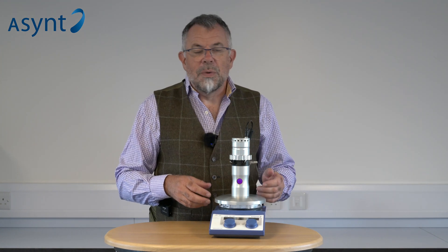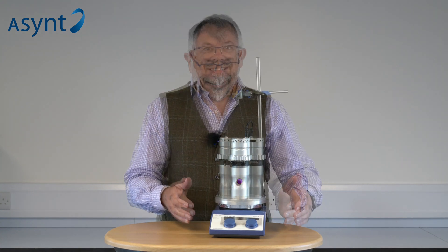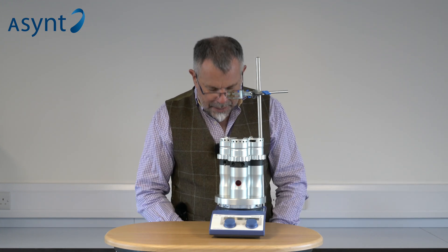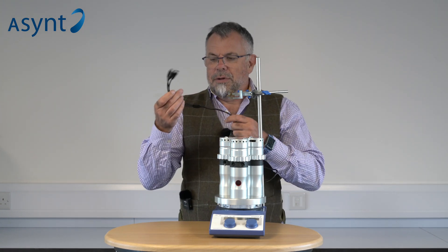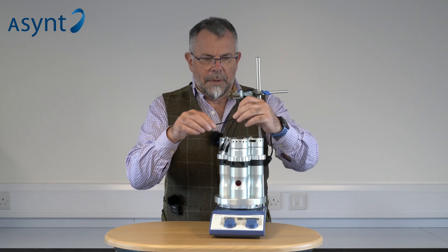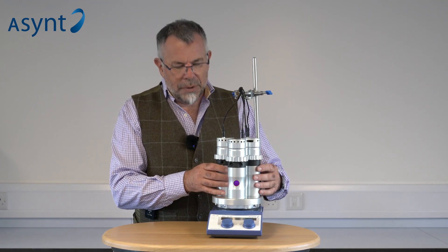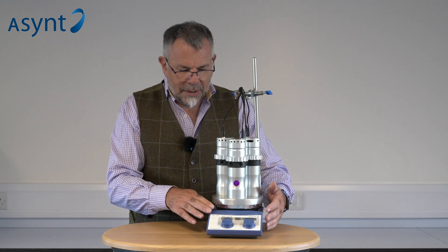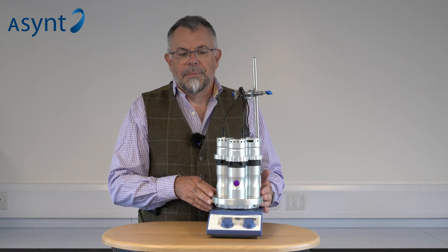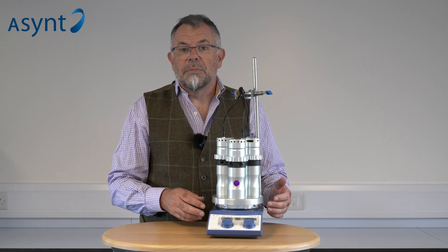One of the things we wanted to do from day one of launch was to make it optionally as a parallel reactor. Let's have a look at that. I've put in a regular retort rod and boss head to support the wires. In this case, we're going to use a three-way splitter connected to the standard power supply. I've now set up a three-position version of Lighthouse — identical modules fitted onto this simple base that allows you to do three at a time within a very small area on a standard magnetic stirring hot plate. Other parallel options are available — bigger versions of this are quite simple; let us know if you'd like that.